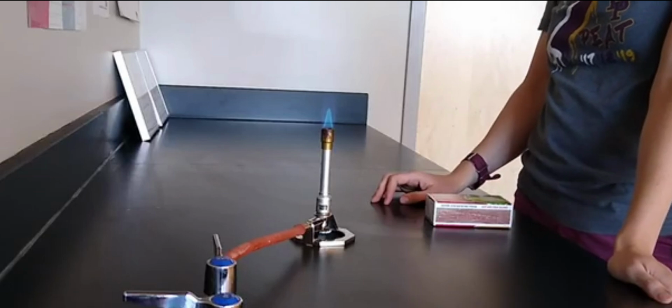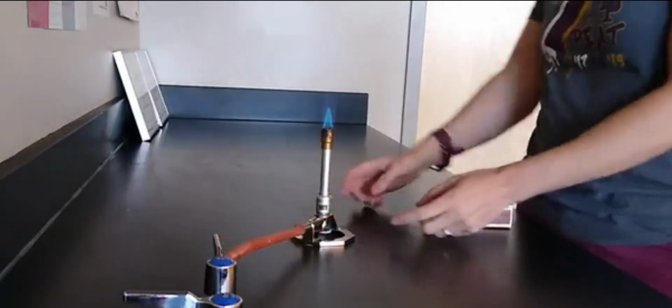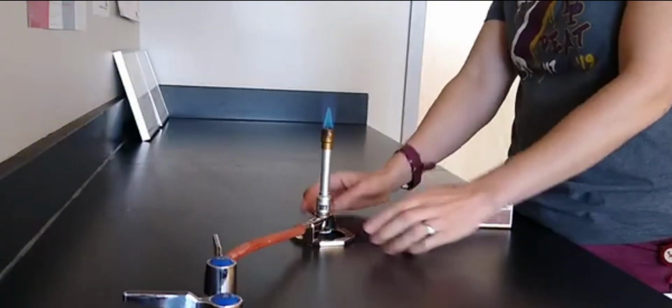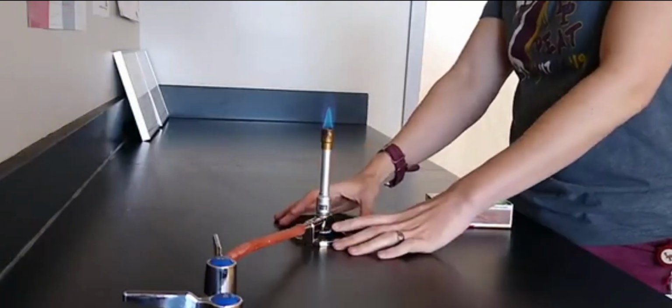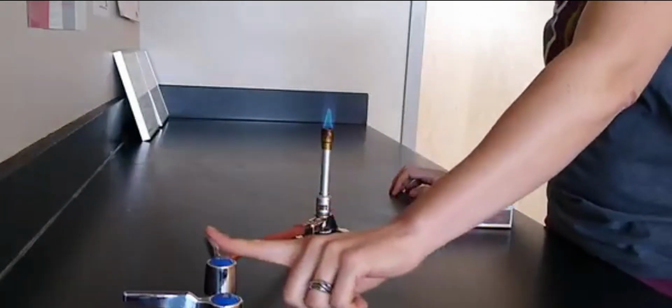Turning a Bunsen burner off. For safety reasons, we want to turn it off at the table first. If I'm messing around with the valve down here and I turn it the wrong way, the screw could come out and flames could shoot out the bottom, and I don't want my hands to be involved in that kind of craziness. So I'm going to turn it off at the table first. Now that the flame is gone, I can adjust the valve, close it up, and close the air vents, and it is ready for the next person to start fresh.